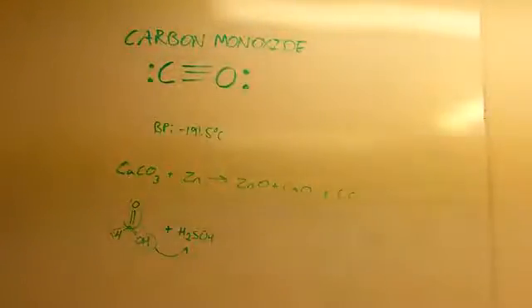Before you begin synthesizing carbon monoxide, you should realize that it's a very dangerous gas. It's responsible for the deaths of thousands of people every year as a product of incomplete combustion in a confined space. The gas is odorless and will reach lethal concentrations very rapidly, especially with one of these syntheses here.